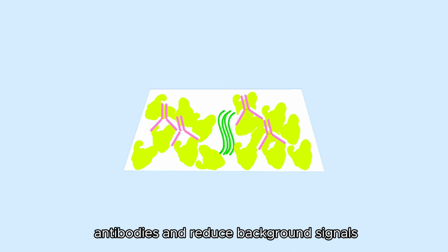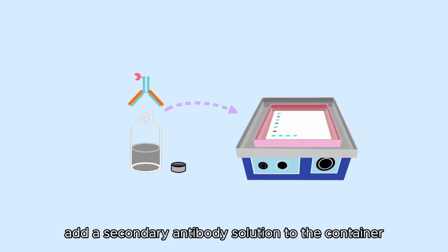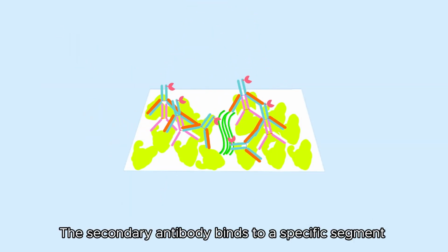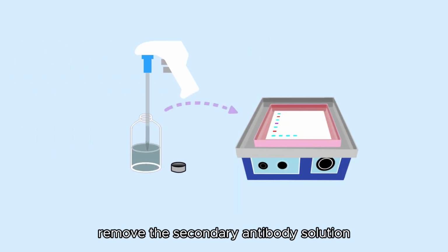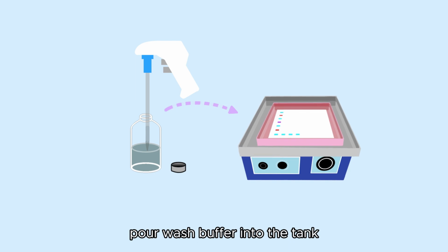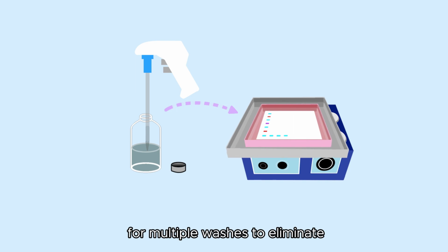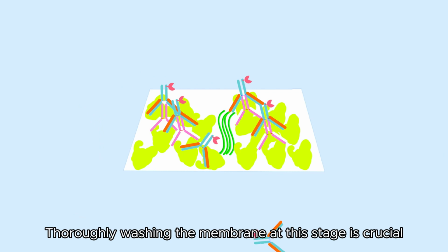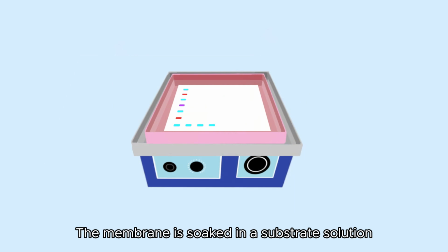and reduce background signals. After washing, discard the buffer, add a secondary antibody solution to the container, and incubate the membrane with gentle agitation. The secondary antibody binds to a specific segment of the primary antibody. After incubation, remove the secondary antibody solution, pour wash buffer into the tank, and incubate the membrane on the rocking platform for multiple washes to eliminate unbound secondary antibodies. Thoroughly washing the membrane at this stage is crucial. After rinsing to remove any unbound secondary antibody, the membrane is soaked in a substrate solution.